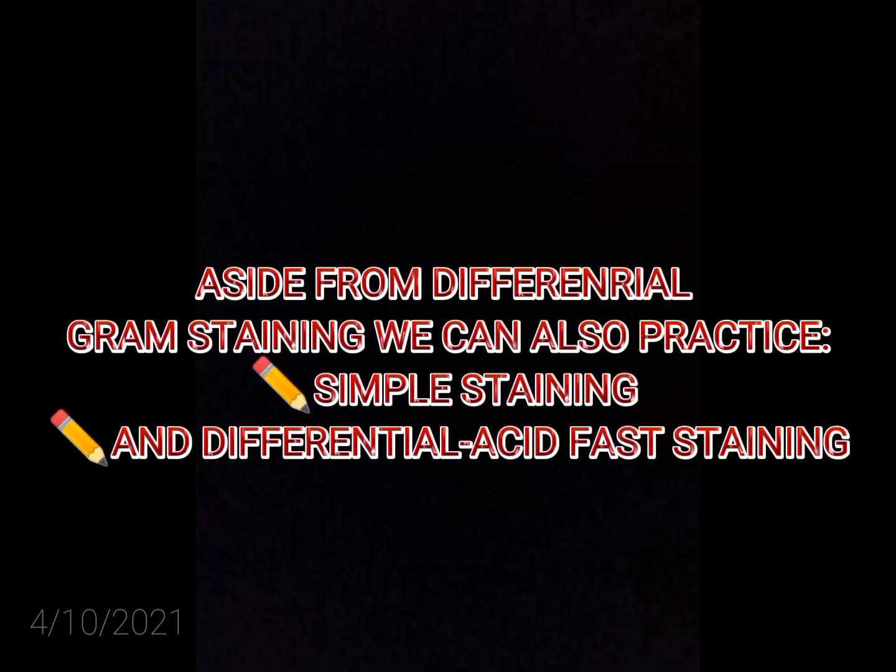What I've done is Gram staining, which is a technique developed by the Danish bacteriologist Hans Christian Gram. It is the most useful staining procedure and classifies bacteria into two large groups, gram-positive and gram-negative. Aside from differential Gram staining, we can also practice simple staining and differential acid-fast staining.